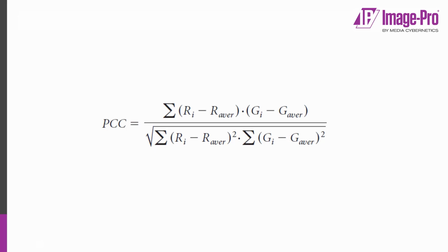Some of our objects are going to find themselves a long way from the image average of red and the image average of green, and so will contribute very negative values to the overall Pearson correlation coefficient.